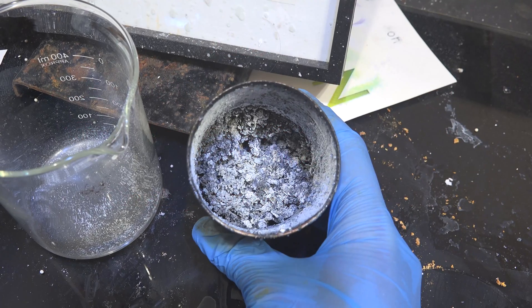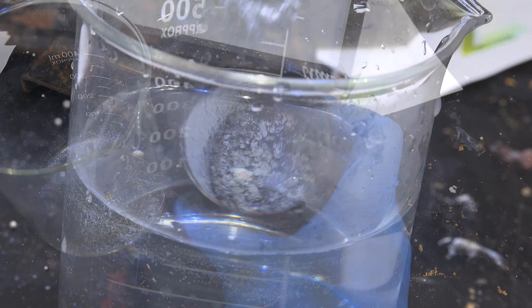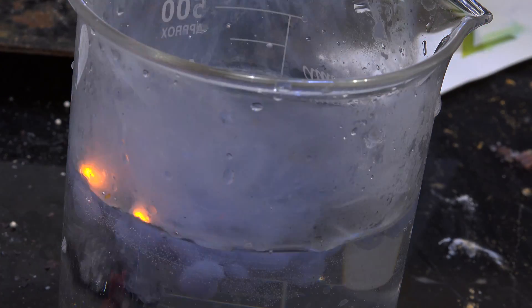Greetings fellow nerds. In this video we're going to make a sodium magnesium oxide aggregate, useful as a substitute for pure sodium metal in most cases.